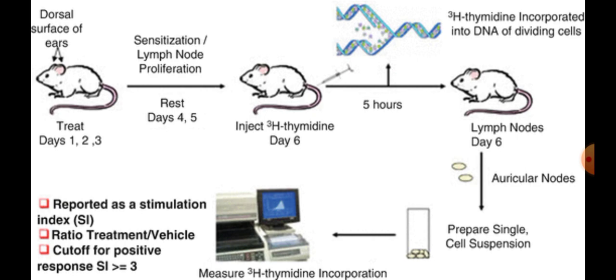The advantages of using the local lymph node assay are the reduced number of animals required, that is reduction, the avoidance of trauma, that is refinement, and the objective endpoint that permits estimation of skin sensitization potency. Still, a skin sensitization assay that allows for the total replacement of animals has not yet been developed.